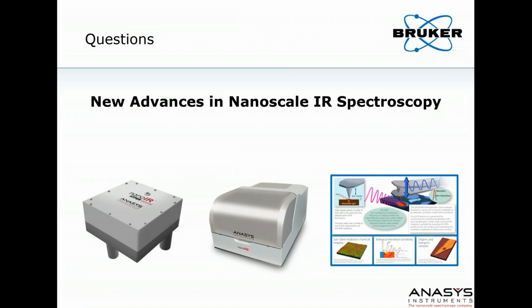And perhaps Bruker now can make something out of the old prism bottom-up approach to be able to do this more effectively. But I think the users that are doing it to date have pretty much taken their Nano IR1s and modified them on their own.